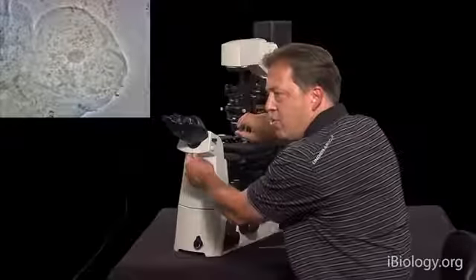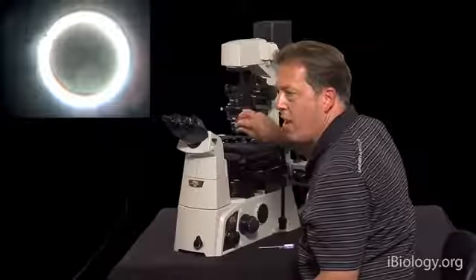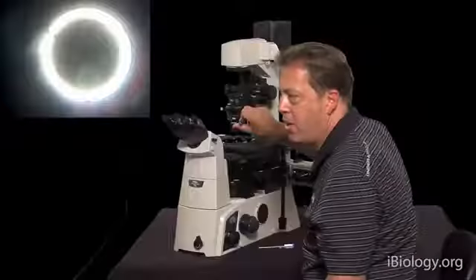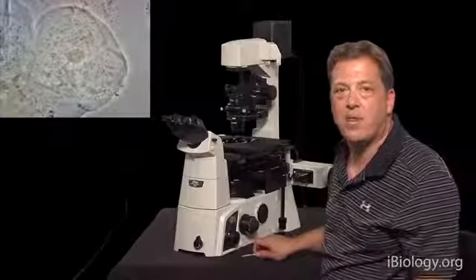Okay? And let's just see what that looks like at the back aperture again. We're moving that phase ring relative to the annulus, actually the annulus relative to the ring. We're moving that annulus back, and once they're perfectly overlapping, we get that nice high contrast phase image.